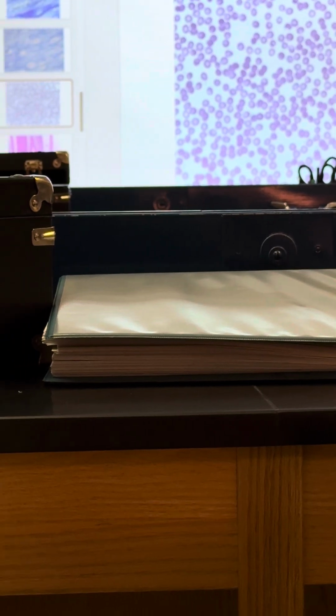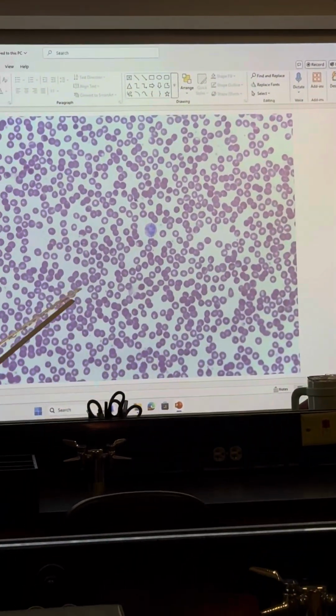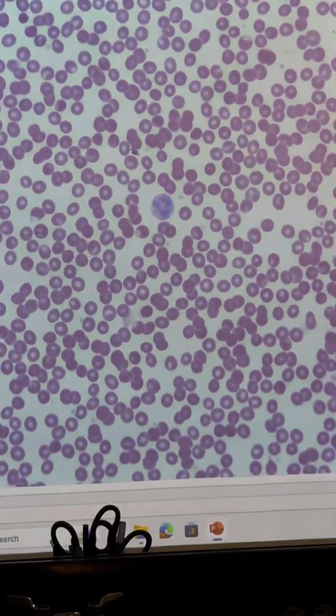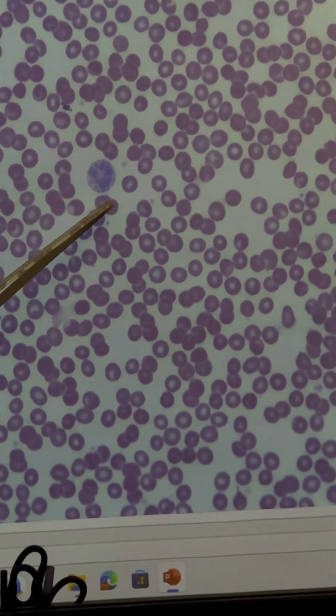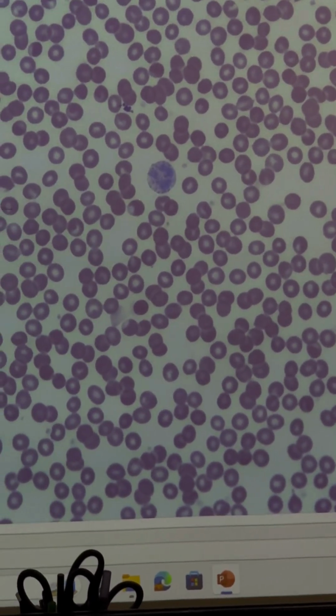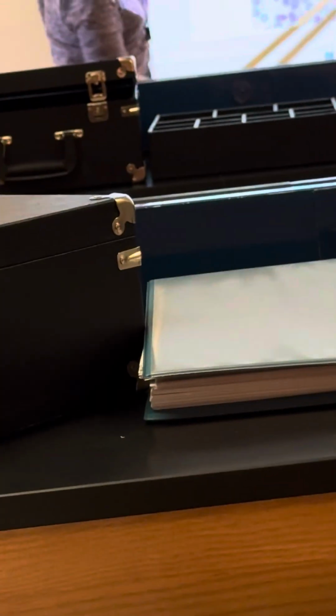What are all the little red cells called? Those are red blood cells or erythrocytes. Most of what you see there is red blood cells. What kind of cell is that? Yeah, a leukocyte or white blood cell. I don't think it asked you specifically, but that is a neutrophil. And then the little tiny specks that you see in there are going to be platelets, for blood clotting.